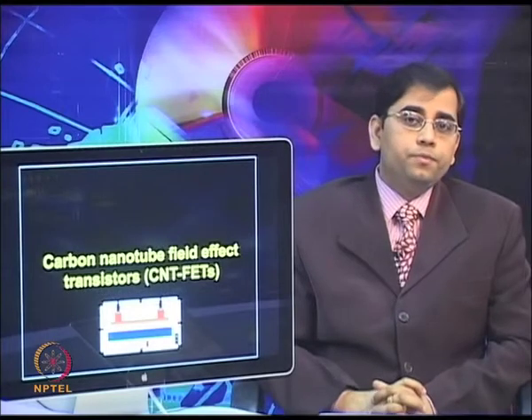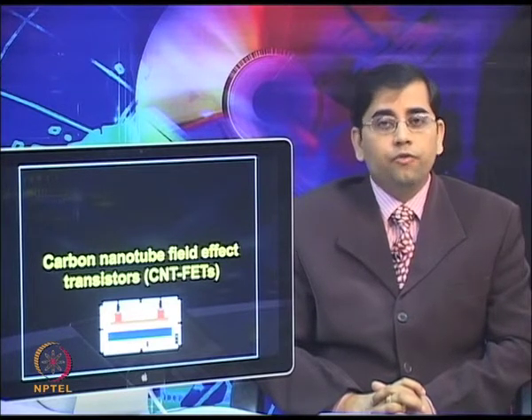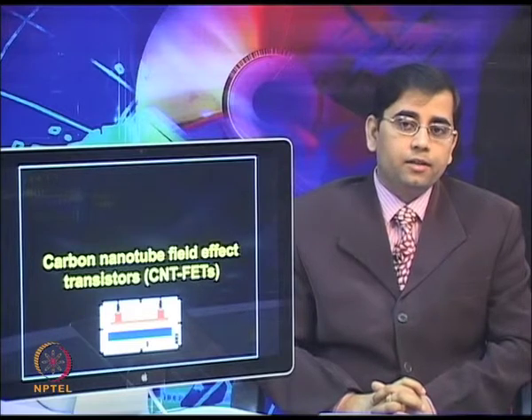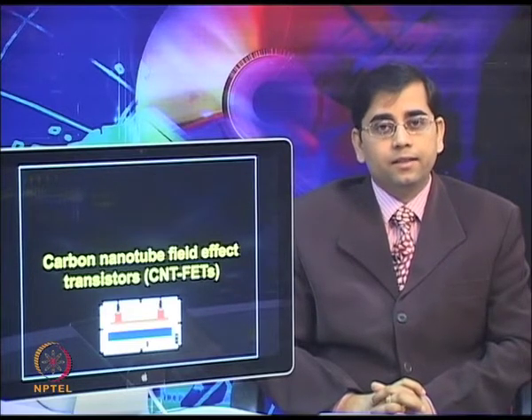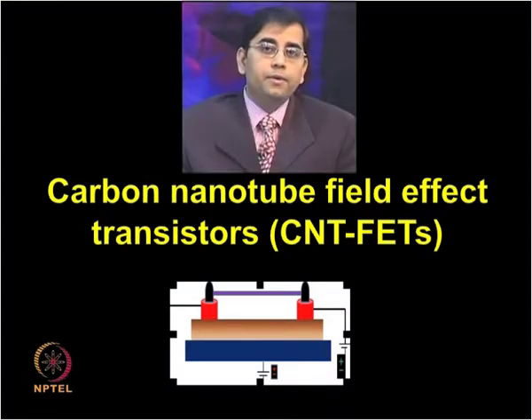Let us now move on to another platform, which is carbon nanotube field effect transistors, CNT-FETs. The successful combination of carbon nanotubes with field effect transistors has led to the development of this novel sensing device known as carbon nanotube field effect transistor.